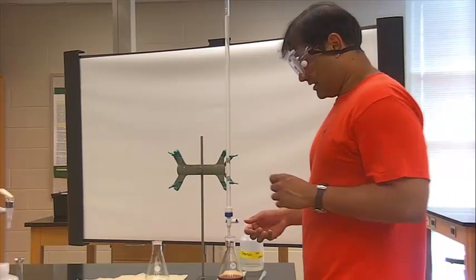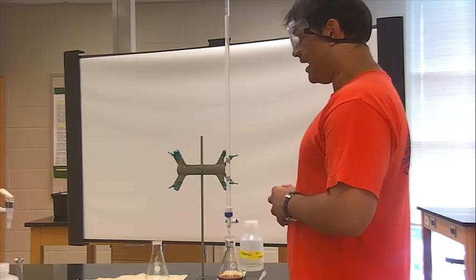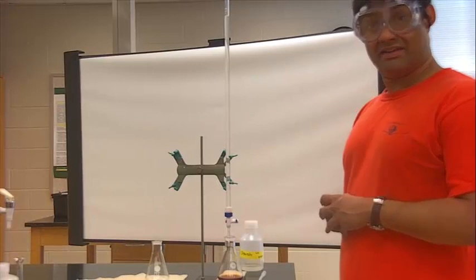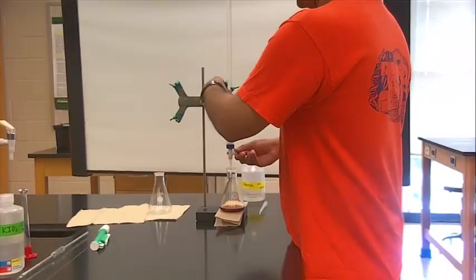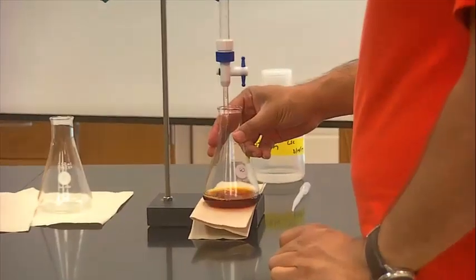So I'm going to do the titration now, and since I've already calculated how much thiosulfate I need to react with the iodine that's generated in the flask, I'm going to go 2 mils minus that equivalence point. So this is easy. I can just let this go. Let's just stir this, keep it stirring.